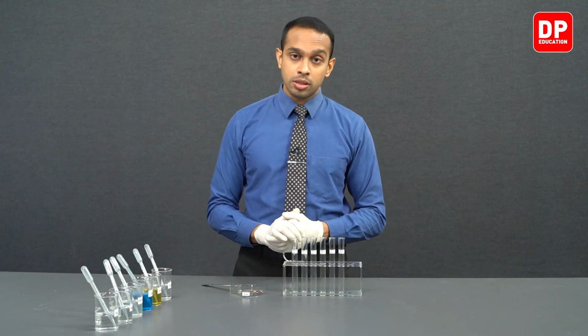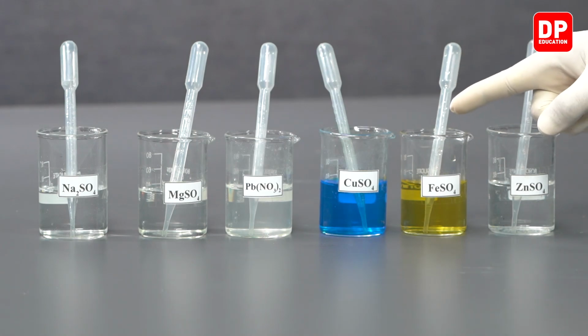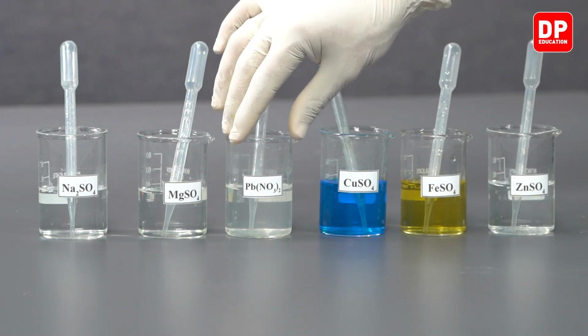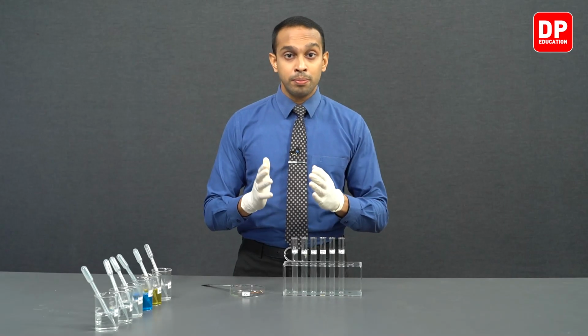Now students, we are going to observe how the metal copper reacts with each of these metal ion solutions. So we have 6 different solutions here: zinc sulfate, ferrous sulfate, copper sulfate, lead nitrate, magnesium sulfate, and sodium sulfate. Now each of these solutions contain different metal ions.